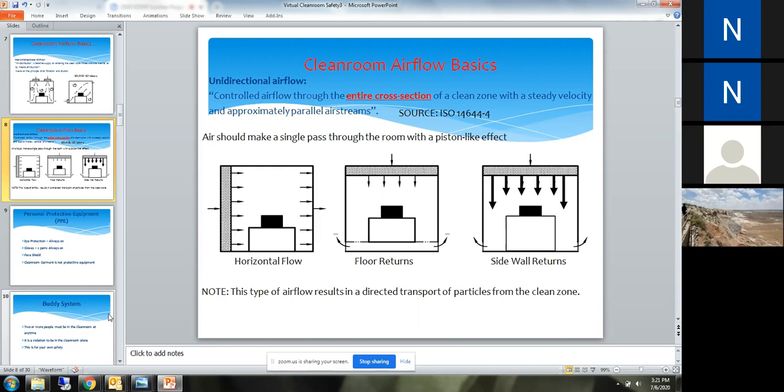We do have computers and a printer with clean room paper, and print what you need out of clean room paper. So any regular paper cannot be brought inside the clean room because of the particles, right? Yes, right. All right.